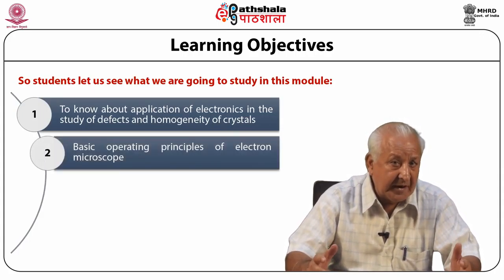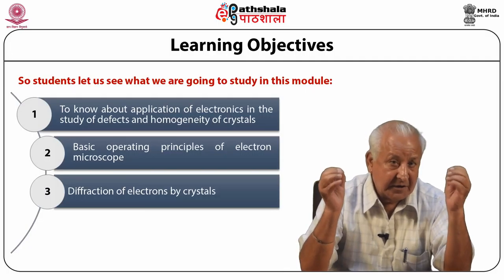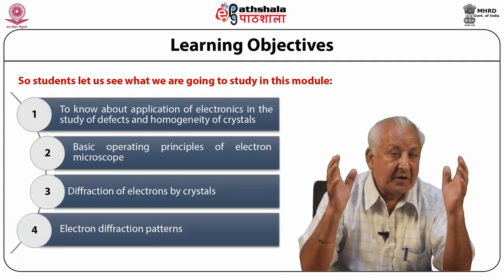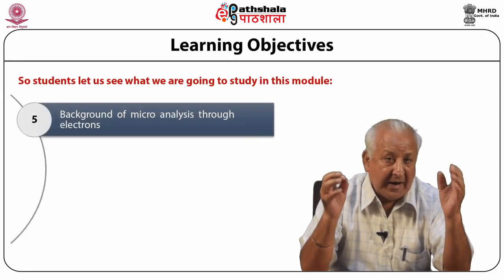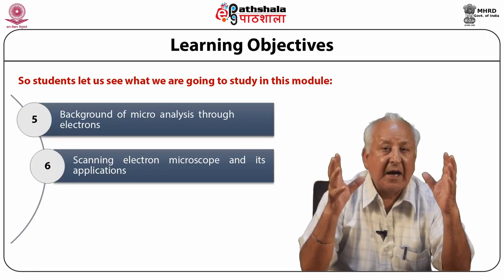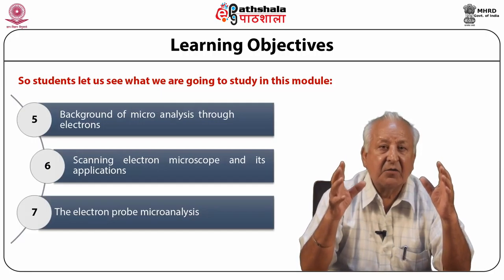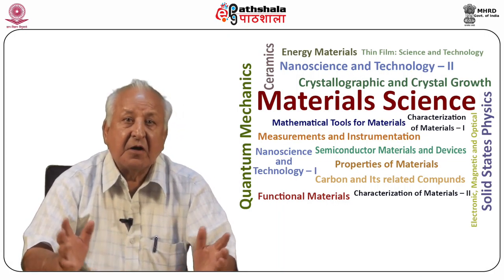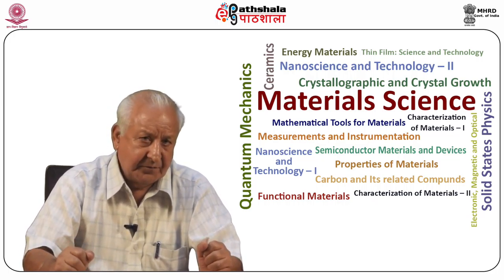The basic operating principles of electron microscope. Diffraction of electrons by crystals. Electron diffraction patterns. Background of microanalysis through electrons, scanning electron microscope and its applications, the electron probe microanalysis. Application of electrons in the study of defects and homogeneity of crystals.